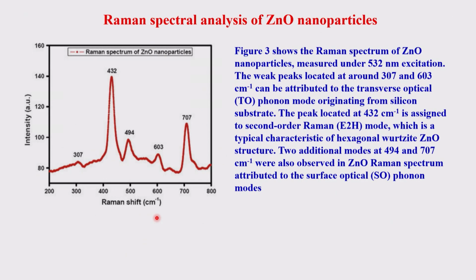Okay, so let us look at some additional examples of the Raman. For example, when used for nanoparticles, I have explained some examples based on the infrared, but based on the Raman, you can see the zinc oxide nanoparticle. In Raman you need to excite at a particular wavelength, and then you look at the virtual state coming back to the ground state. That is where you pump in, so more and more intensity can come. That is what is called the resonance Raman. Under that, certain vibrations will get more intense than others.